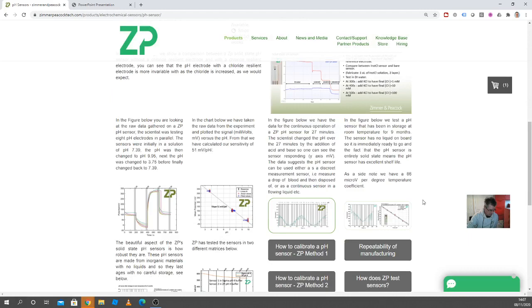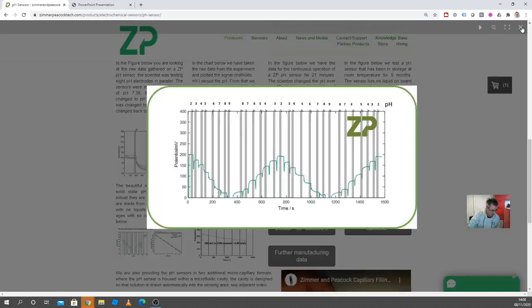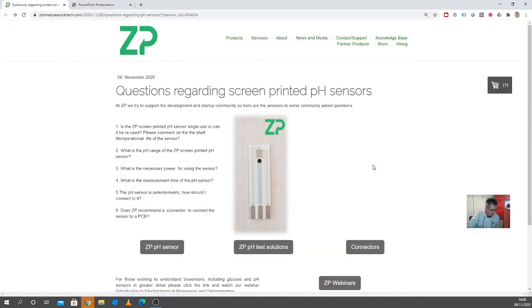Operational life is a different question. Clearly here, we've operated this sensor for about 30 minutes — about 1600 seconds — and the sensor is perfectly fine. Operational life really depends on how you're using it and the solutions you put it in. If you put it in a very corrosive media, its operational life could be quite short. If you put it in quite benign solutions, like pH seven, it could operate for quite a while. The shelf life is officially six months, though I think it's longer. The operational life really depends on you and your application.